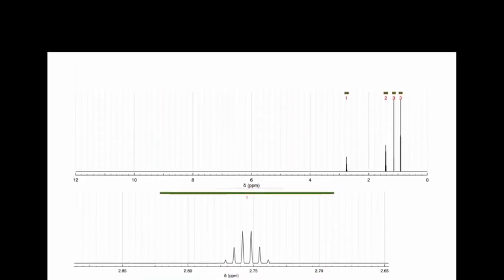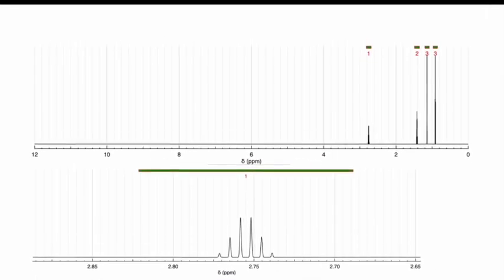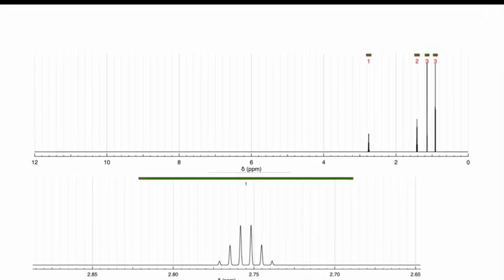This is from this data bank of NMR spectra that's just very helpful because they're really, really high quality spectra. We'll take some spectra in lab and you'll see, but our NMR instrument isn't really the greatest thing in the world, and so our peaks tend to be sort of smushed together, and it makes it a little bit harder to analyze what's going on. So we'll look at a few really pretty data sets at first so we can get used to the process before we graduate ourselves to the dirty data sets.